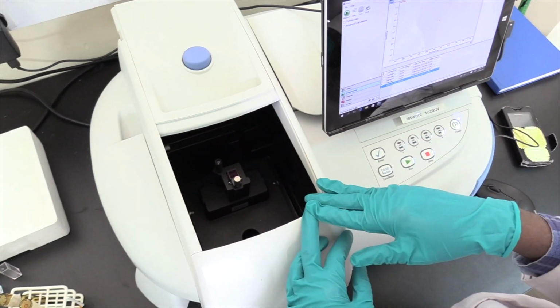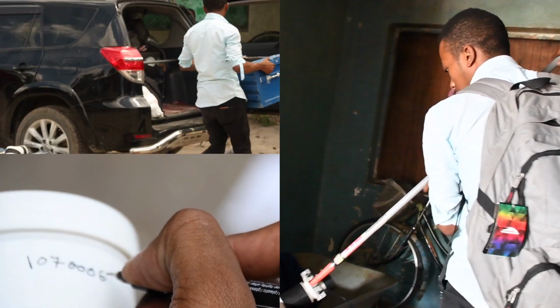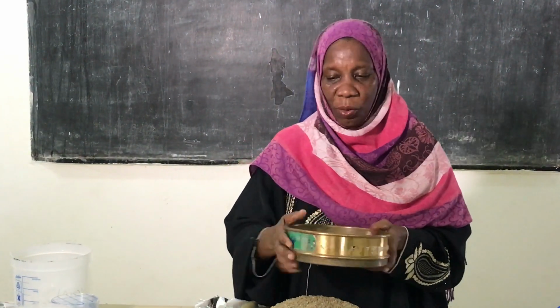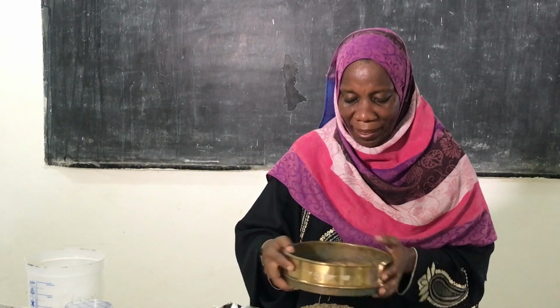It is important that you know how to collect, label, transport, register, and store your samples for data analysis. So please follow the instructions provided in this film and remember to check available literature for further details.